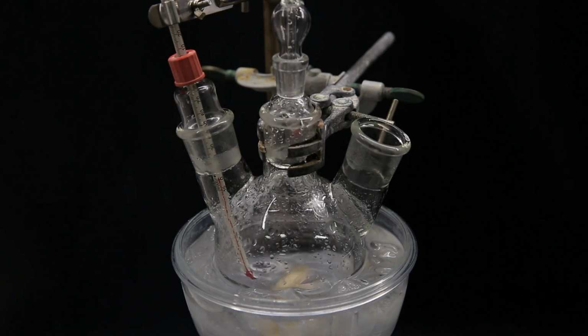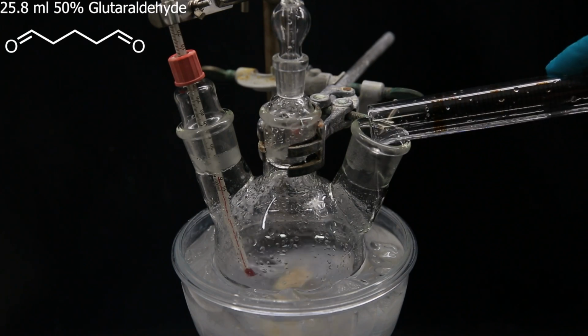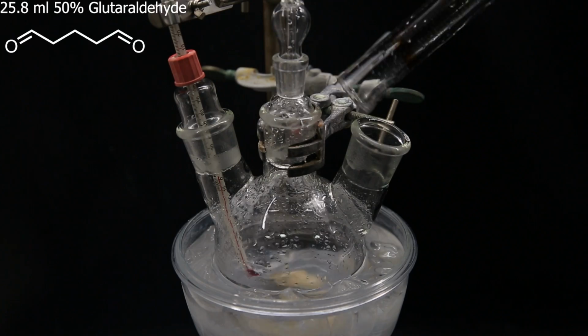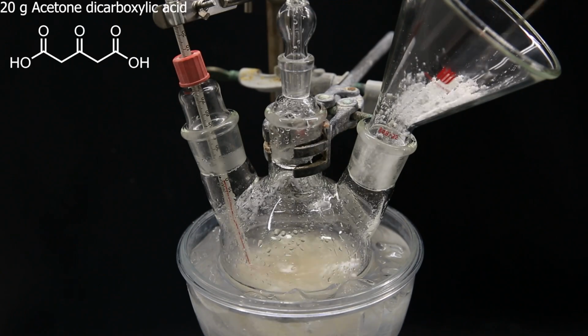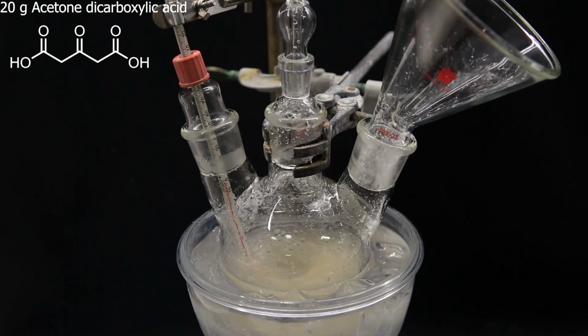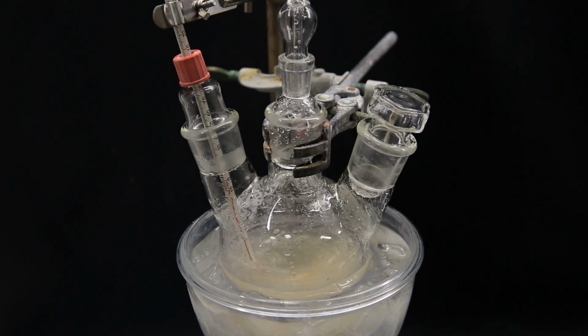When the addition is complete, I add in 25.8 ml of 50% glutaraldehyde as the second reagent. Then I attach a funnel and gradually add in 20 grams of acetone dicarboxylic acid as the third reagent, while maintaining the reaction temperature around 5 °C to prevent decomposition. The solution has become yellow and I stopper the open neck.